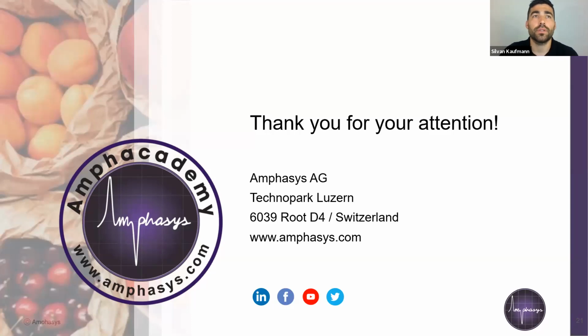Now, we talked a lot about wheat. There came a question whether it's also possible to measure other small grain cereals with the same setup, with the same chip. I roughly talked about that. Basically, the chip is the same, so you can use an E-chip. You can also use the buffer that we were using. So the setup is quite the same. If you are interested in measuring another species, then just contact us. We also are happy to help you with that.